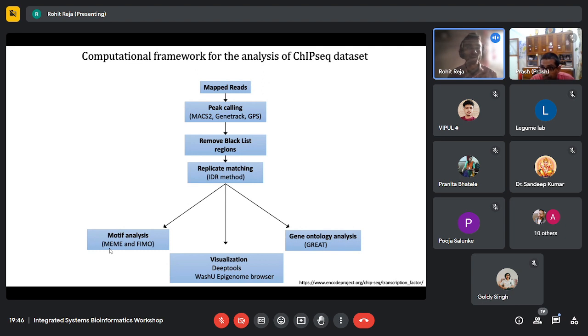But I think the downstream tool is where, like the motif, for instance, let's say you did this and you can run MEME because MEME will give you a motif. Now you've got the motif, but the motif database probably will not have a good collection of plant motifs that are most commonly accessible, that are most commonly found. So you will get a motif, but then you won't know exactly what this is. You won't know what it does.